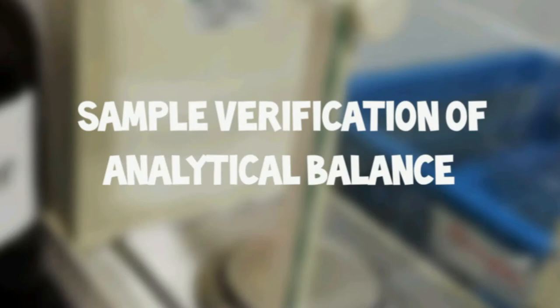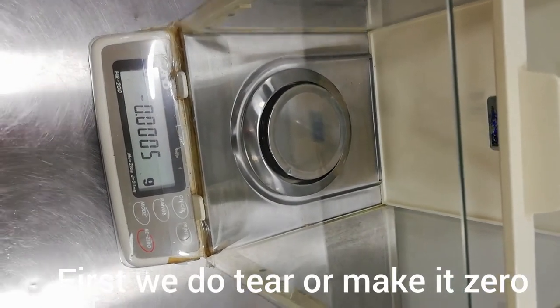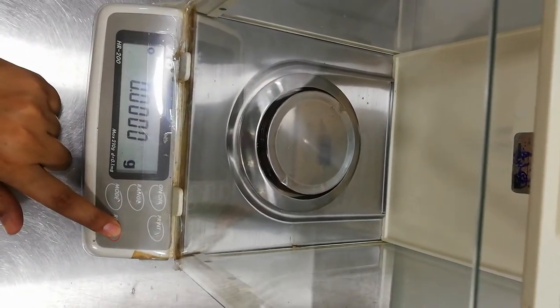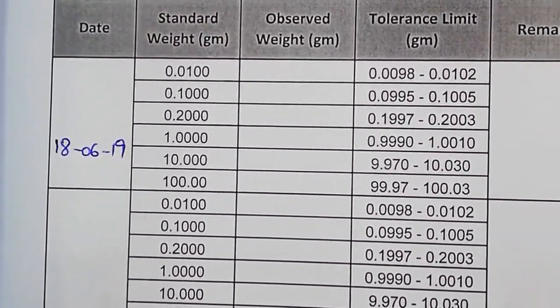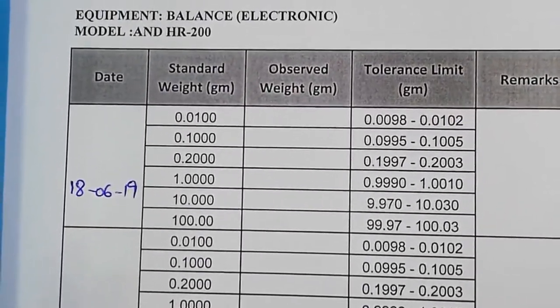Let me show you a dummy verification of the analytical balance. First, we tare it and make it zero. This is my data sheet, and I will explain it in detail at the end of this video.